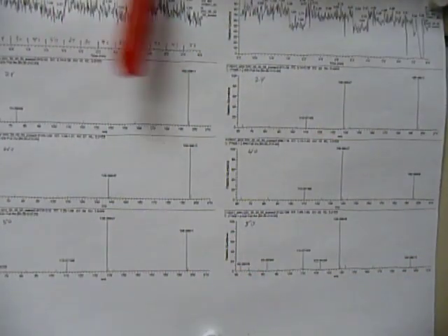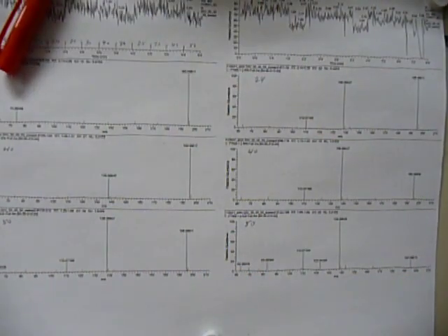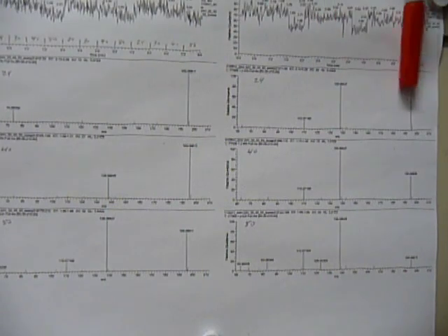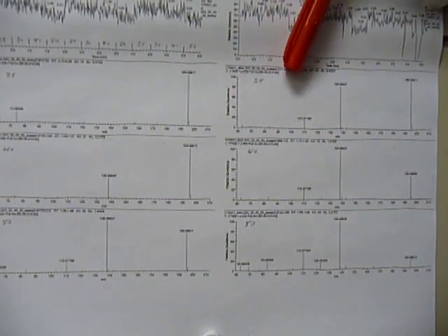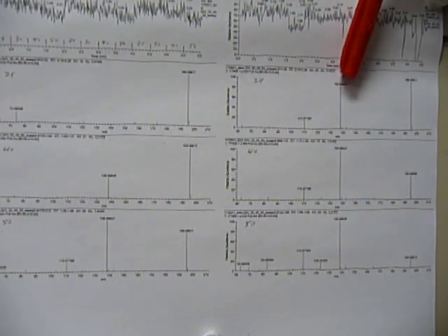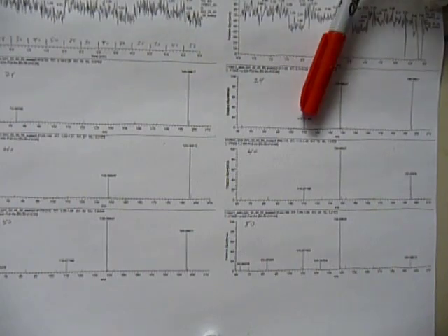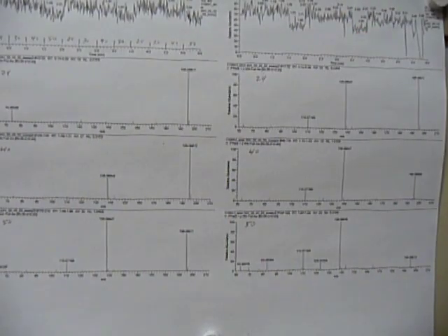And the other way we can induce fragmentation is having this low voltage, but increasing the sweep, say, to two. And now, we have the 138 and the 110 ions for fragmentation.